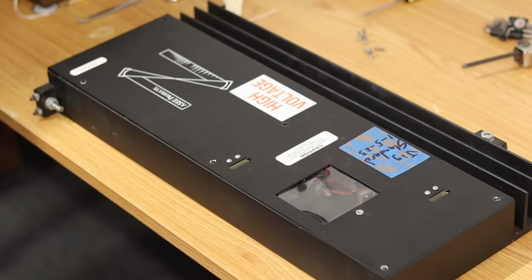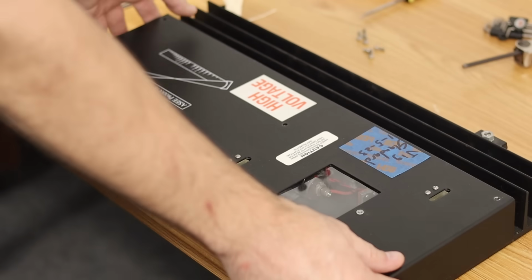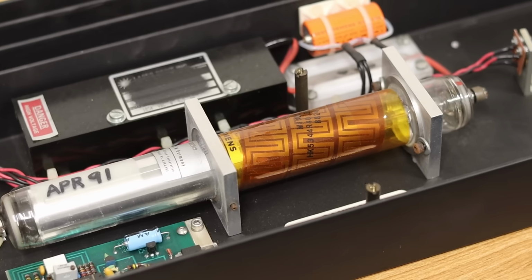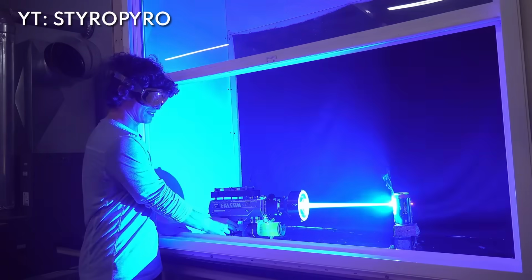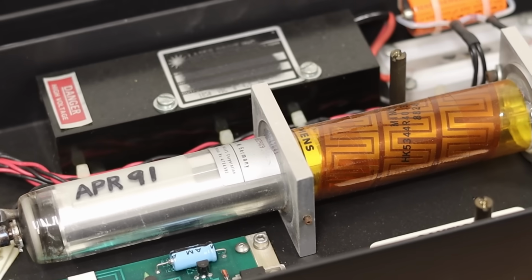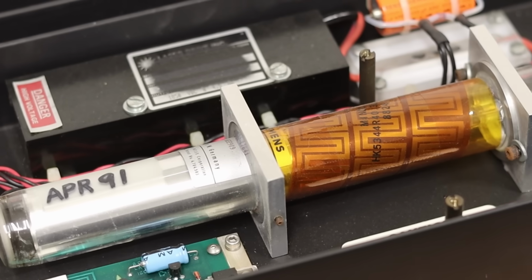It says high voltage on it, and there's lots of warnings about laser radiation going on here, but if we take this top off very carefully, you can see the helium neon laser tube right here in the center. Nobody tell Styro Pyro, he'll make this thing handheld and use it to cut Coke cans in half or something, but this laser, aside from being beautiful, is absolutely essential to getting this spectrometer to work.